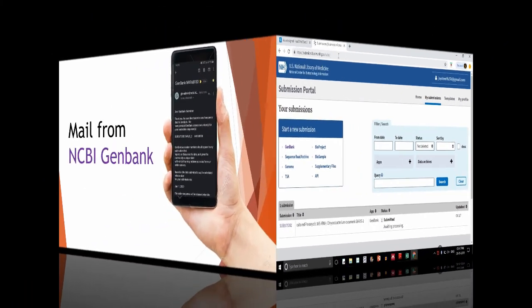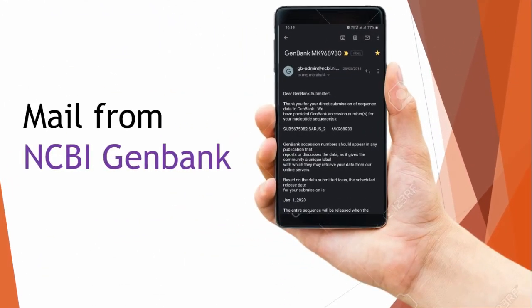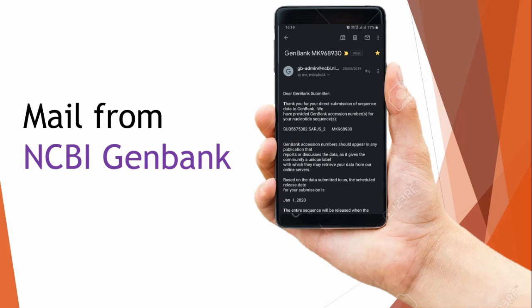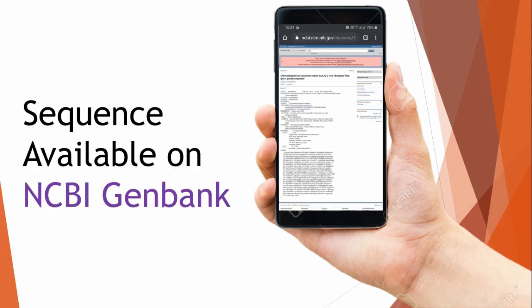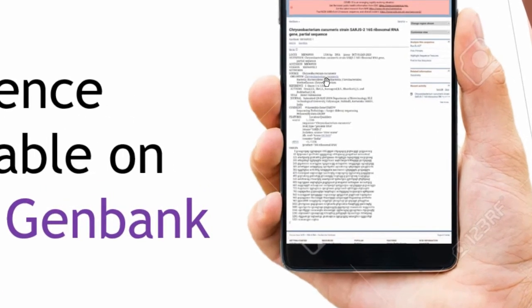This is the mail I received from NCBI GenBank. Thank you for your direct submission of sequence data to GenBank. We have provided GenBank accession number for your nucleotide. MK968930 is the accession number assigned for my submission. You can look at this point here: based on the data submitted to us, the scheduled release date for your submission is January 1st, 2020. I will show you the next screen.